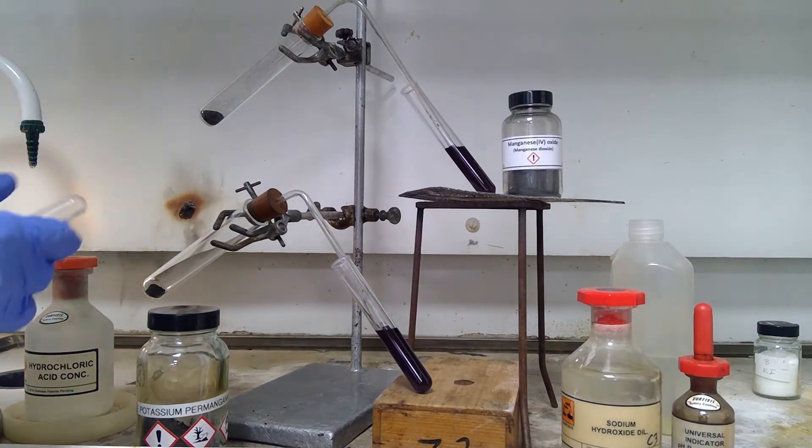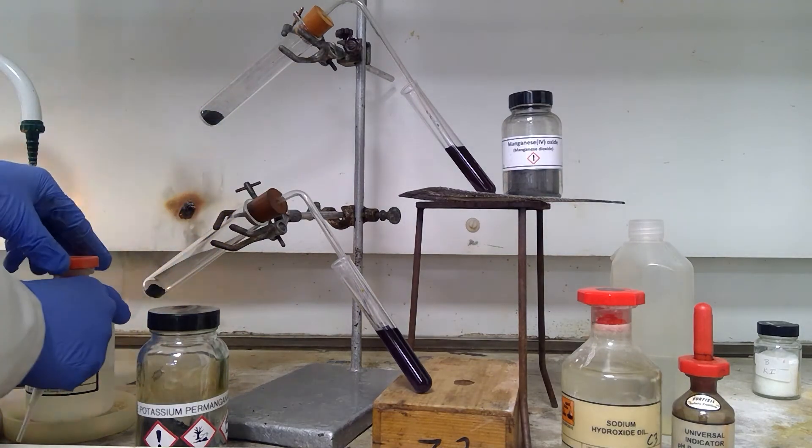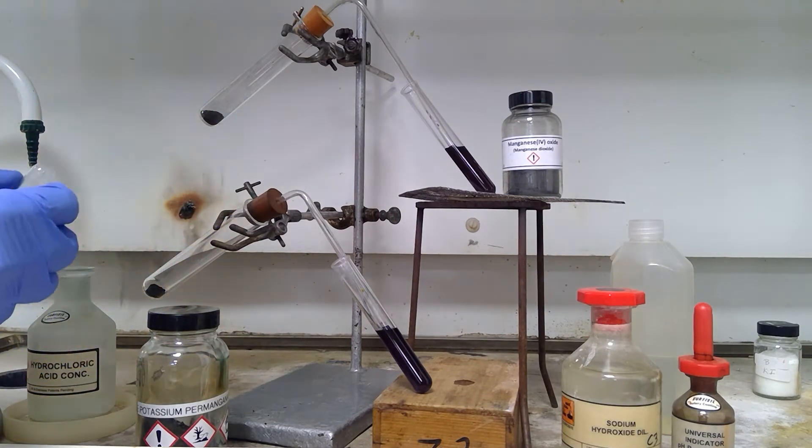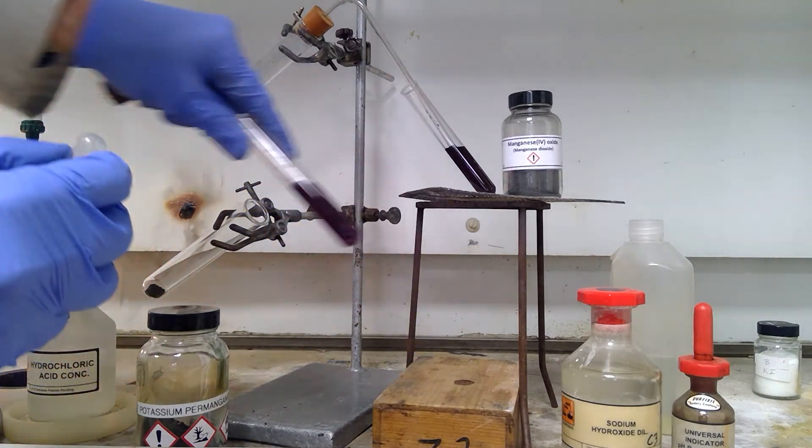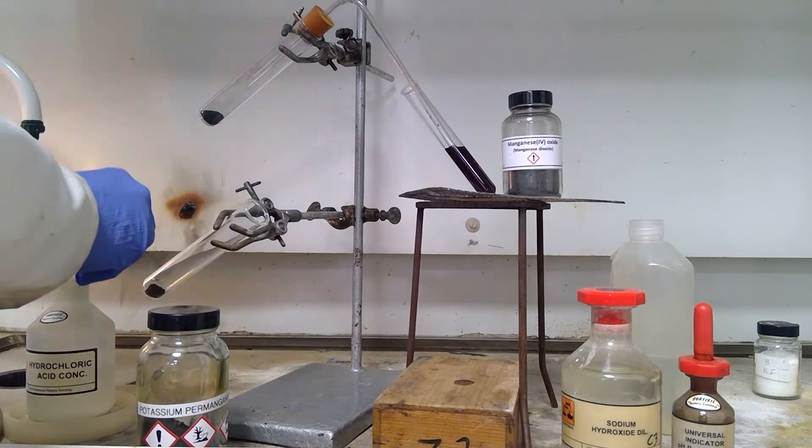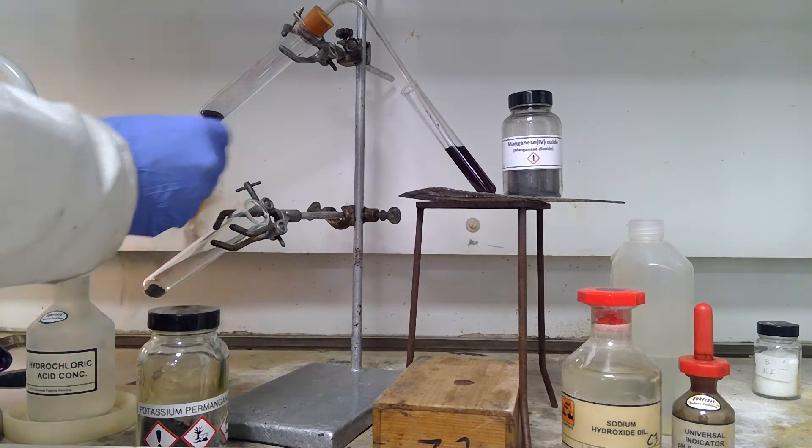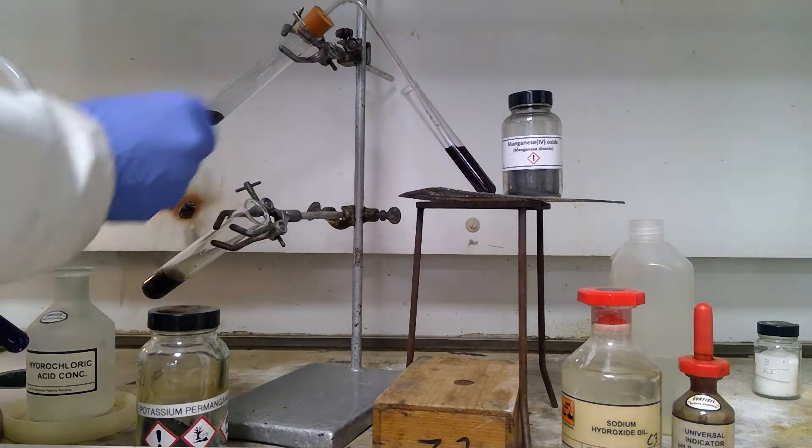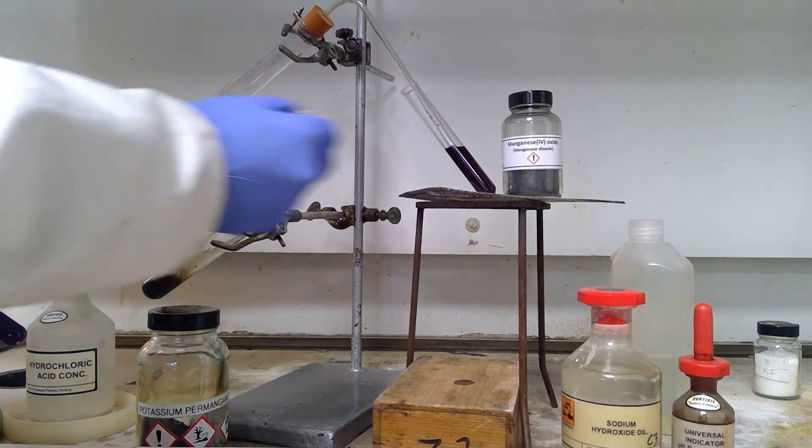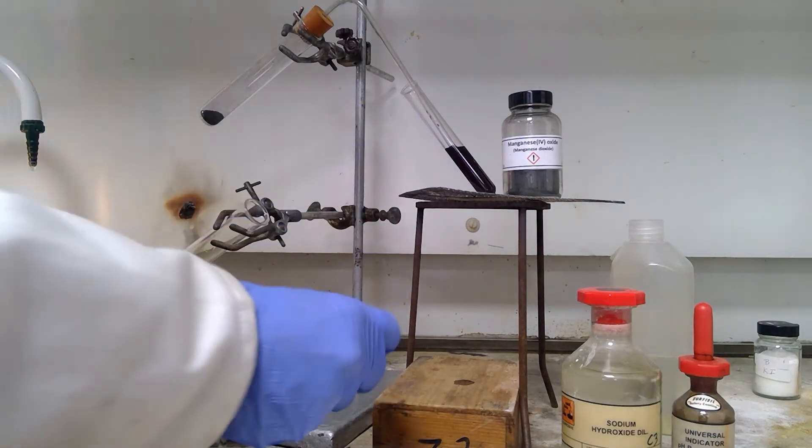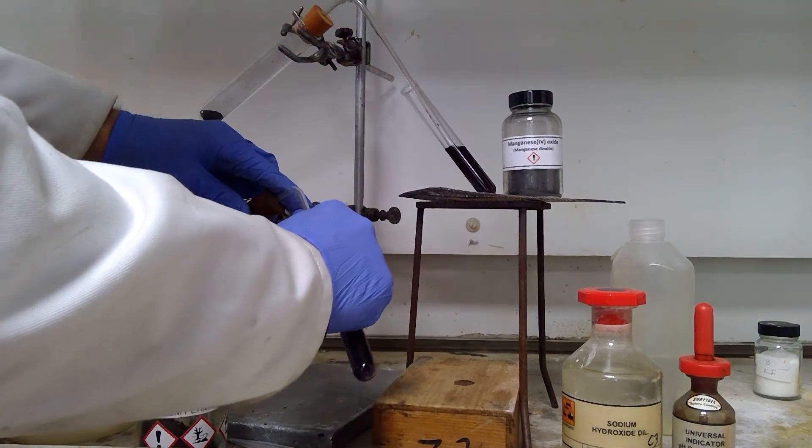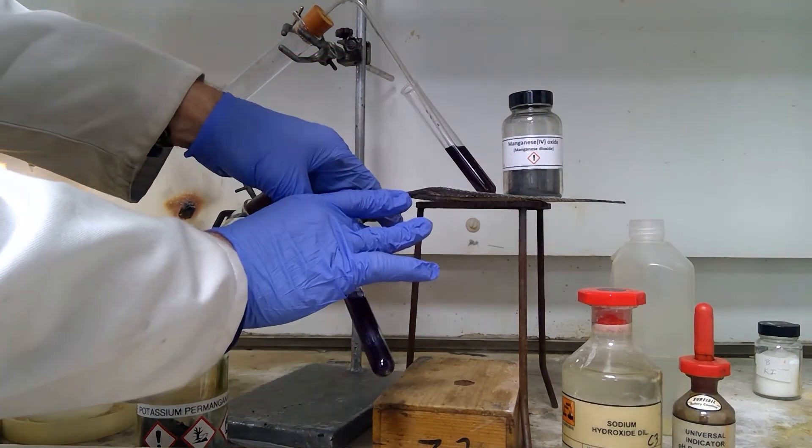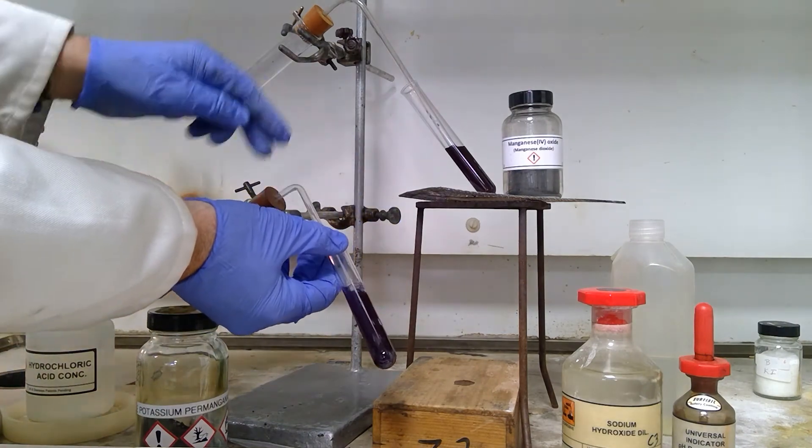So first, we're going to add some concentrated hydrochloric acid to the apparatus at the bottom, about 3 cm³. You can see that the gas is produced very rapidly. You can see very quickly that a gas is produced.